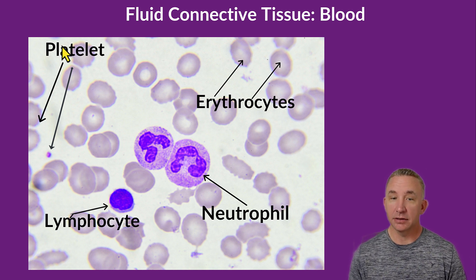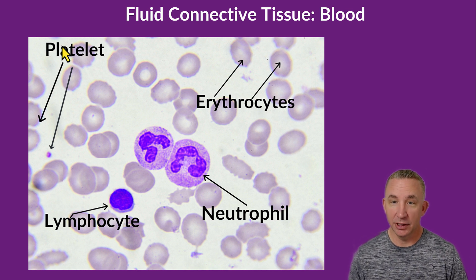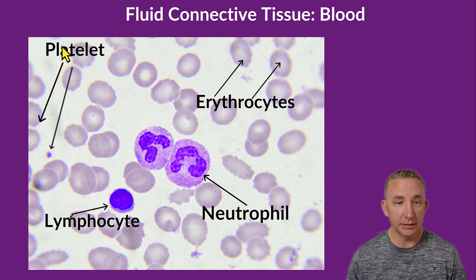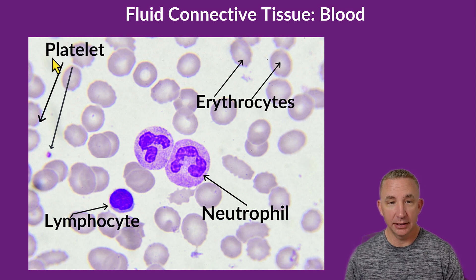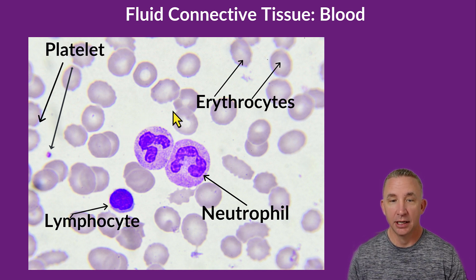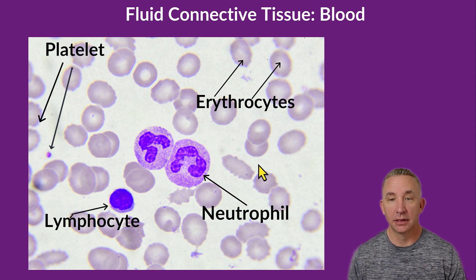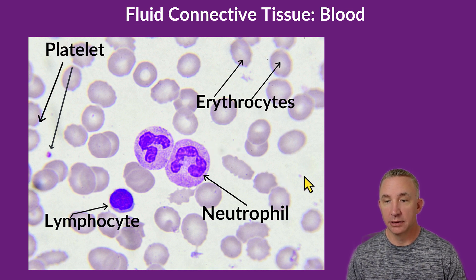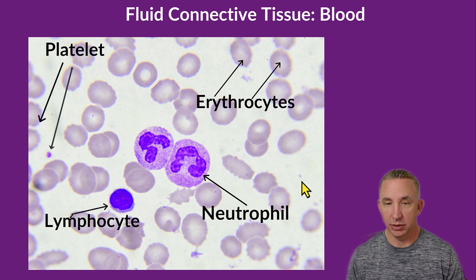Then I have little specks throughout, and I've highlighted a couple of them as platelets — just these tiny little specks. Remember, they're just fragments of cells. These are platelets that we use for clotting.